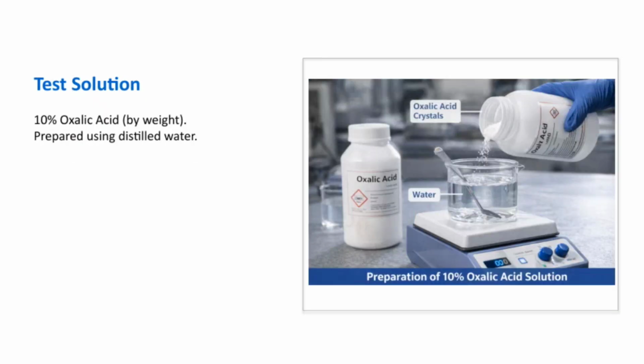Let's take a look at the test solution we used. It consists of 10% oxalic acid by weight. This means that for every 100 grams of solution, 10 grams are oxalic acid. We prepared this solution carefully using distilled water to ensure purity and consistency. Using distilled water is important because it helps us avoid any impurities that could affect our results. Overall, this test solution is a crucial part of our process, helping us achieve accurate and reliable measurements in our experiment.